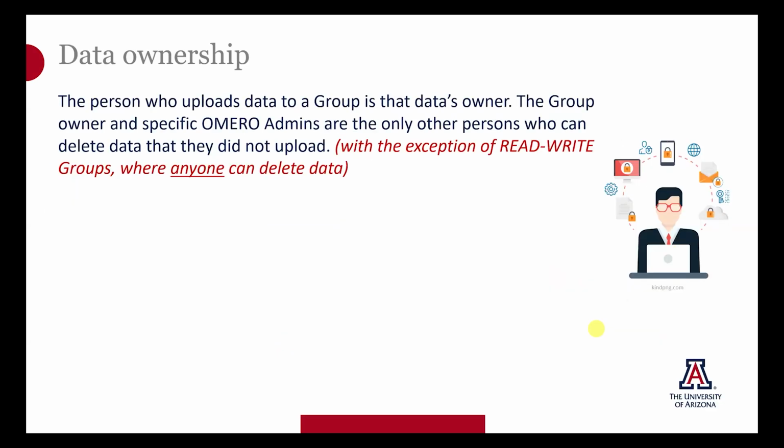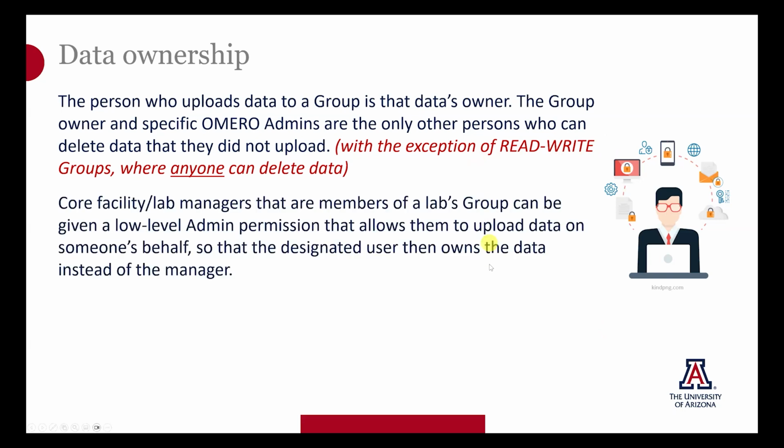As you work in OMERO, it's good to remember that data is owned by the person who uploads it. If the data is uploaded by an undergraduate student, it becomes the student's data, and they also have the permission to delete that data. In almost every one of the four group types, the group owner or owners can also delete data. If there's a situation where someone is a regular user of a core facility and you'd like the core staff to upload your data on a regular basis, but you'd like them to do it in the name of the person who actually captured the images, this can be done.